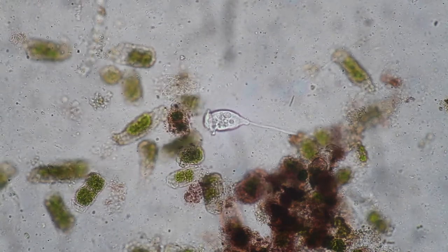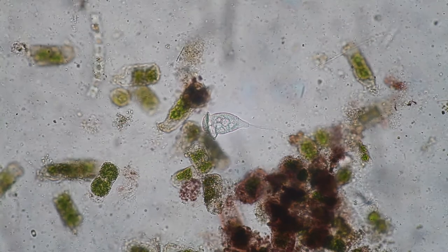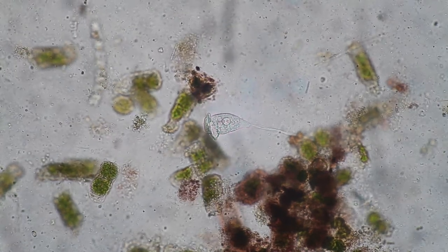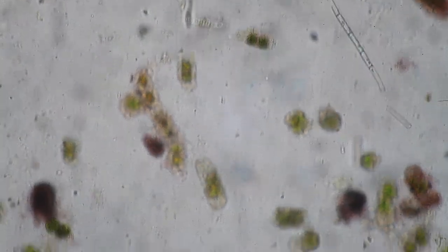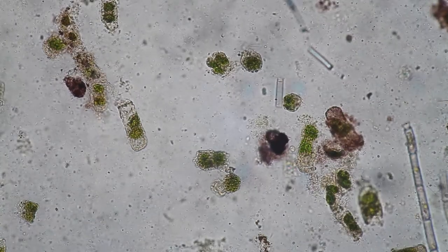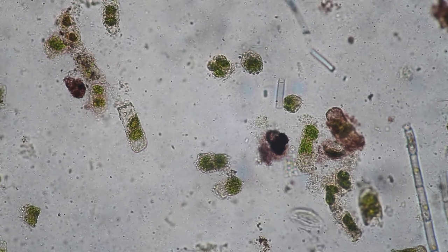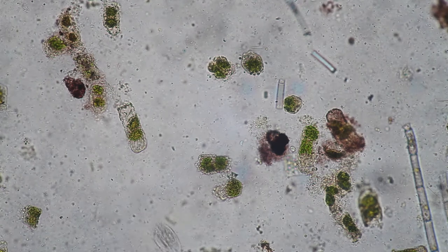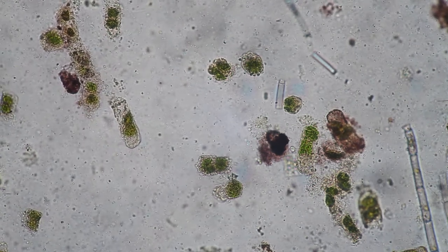That is basically what I'm doing. I'm simply observing my own videos and narrating them, and it's not scripted. So I'm simply improvising, and this also gives everything a more natural and authentic impression. There's one thing that you might notice in the background: some slightly bluish gray shadows. That is dust on the condenser of the microscope, and that means my microscope has to be cleaned again.